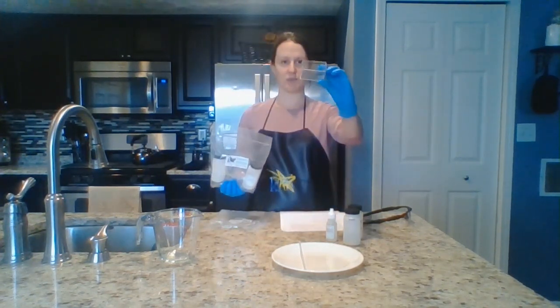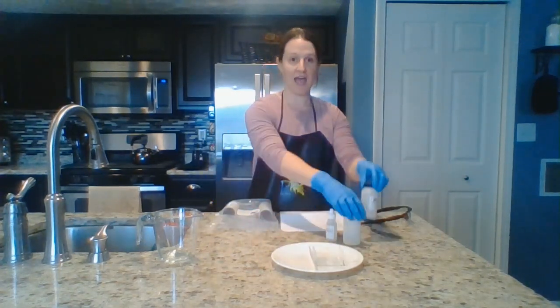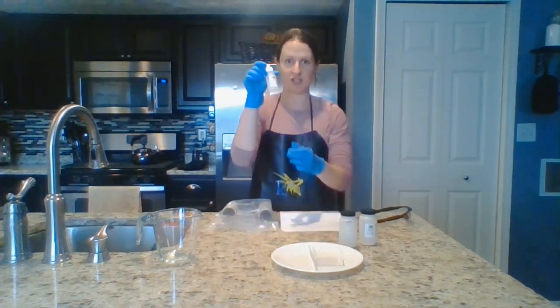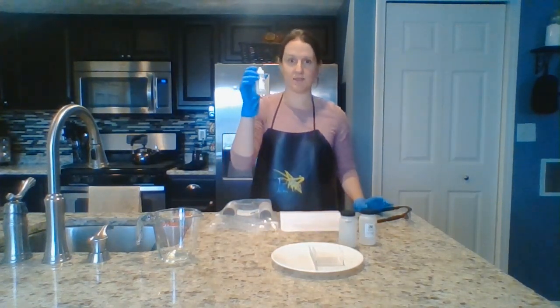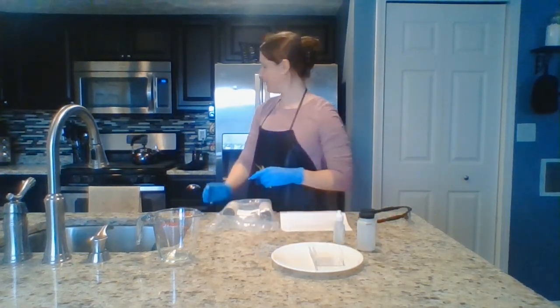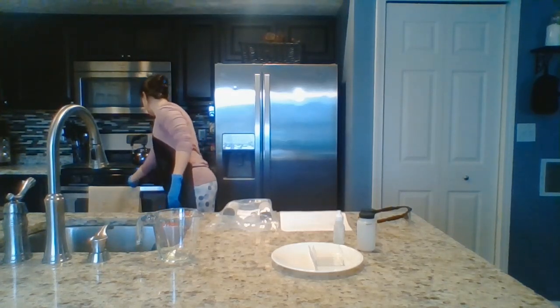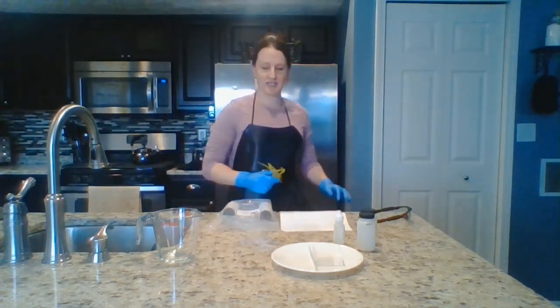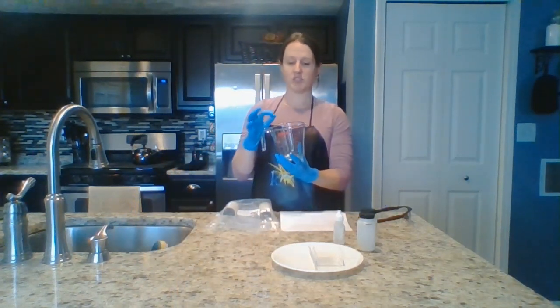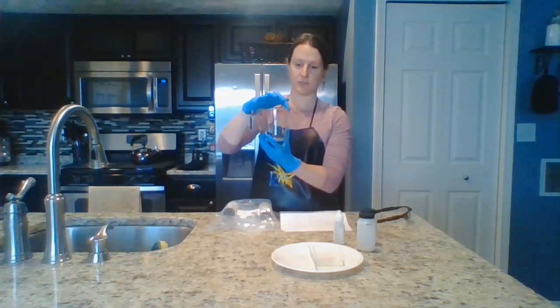Inside this kit, there's a little plastic tray, a stirring rod, your agar in 2 separate bottles, and sodium hydroxide, which is going to make a really cool color change. You'll also need boiling water. So I have a kettle over here. Let's get that warmed up and get it started. And we're going to have to carefully pour boiling water. So I'm using a measuring cup that has a nice little pourer as well.